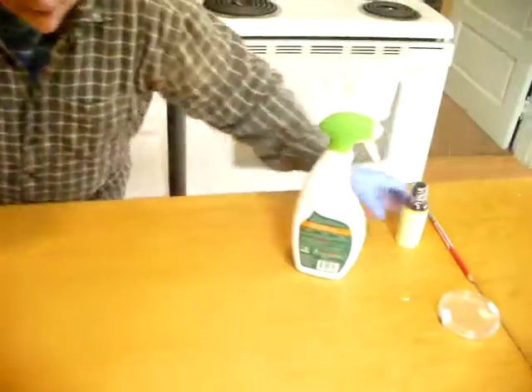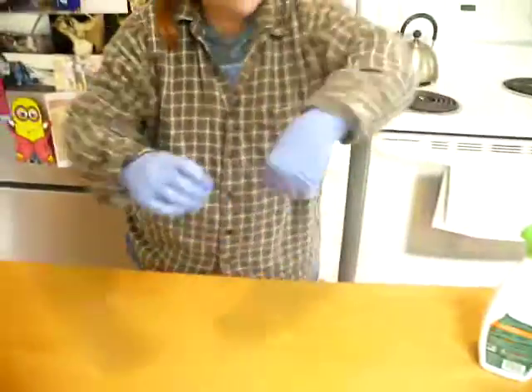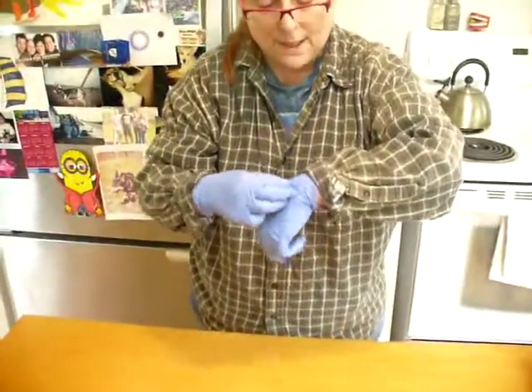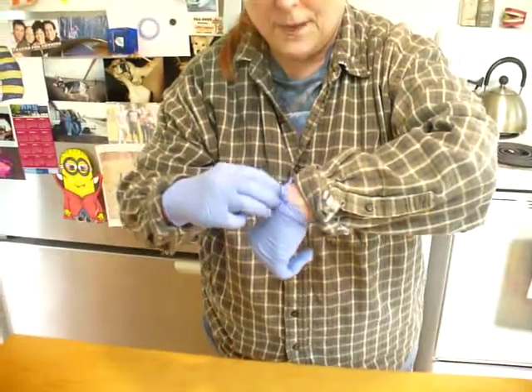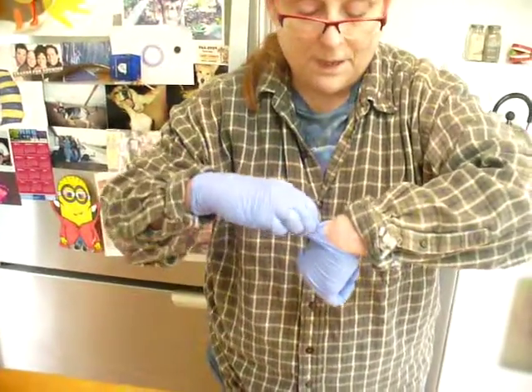Then I will put away my Bunsen burner once it's cooled off, throw away my paper towel, and take off my gloves. I'm going to grab them — I'm not going to touch my hand if I can help it.